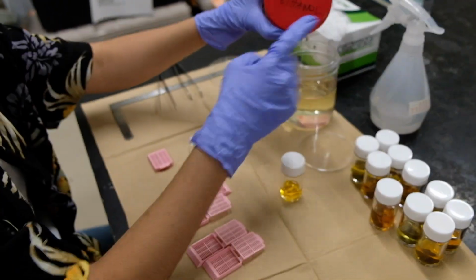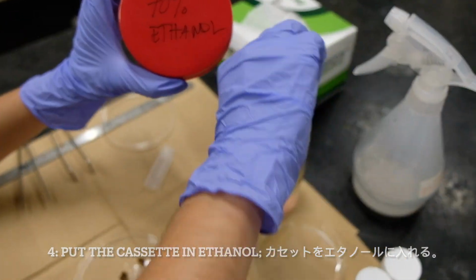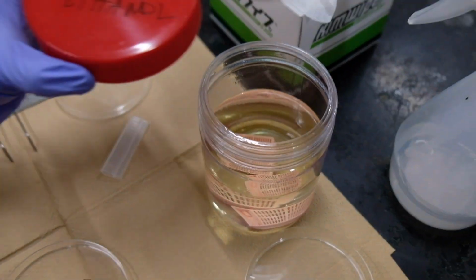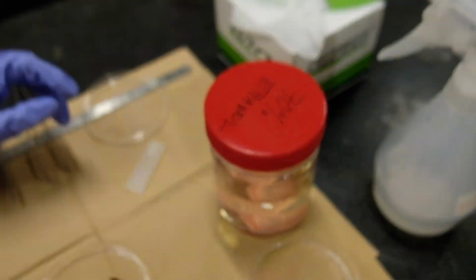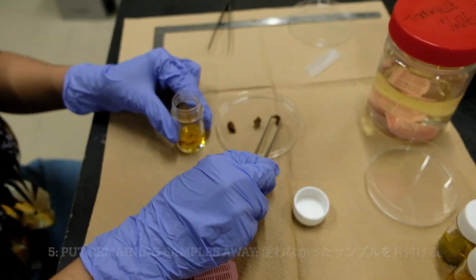Once that sample is in the cassette, we can then take the entire cassette with the sample in it and put it in your jar of 70% ethanol. And finally, we can take what remains of the samples and put it away.